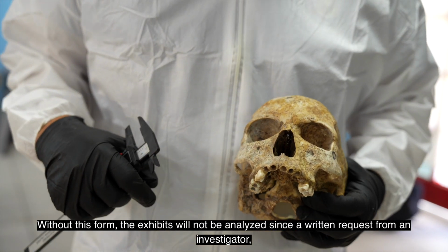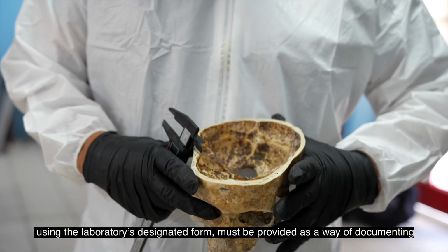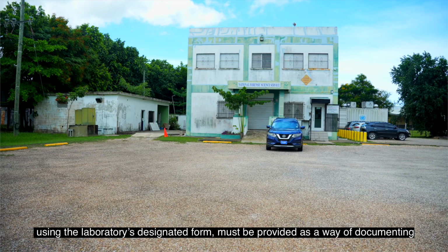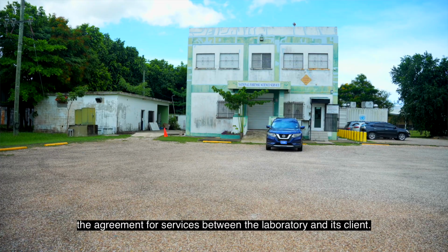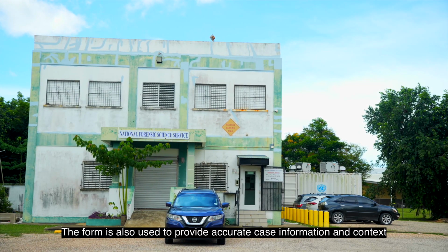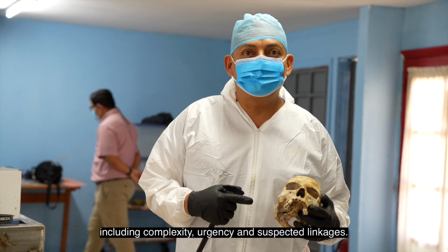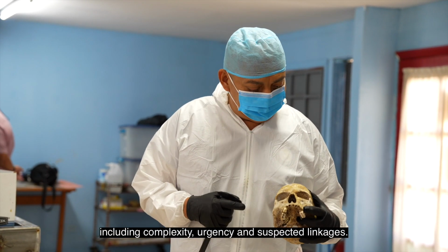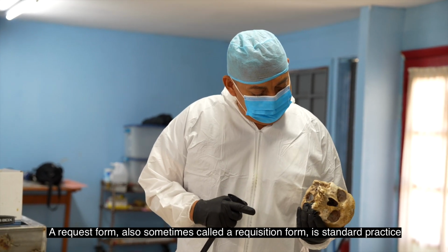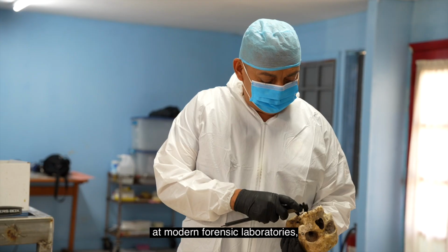Without this form, the exhibits will not be analyzed, since a written request from an investigator using the laboratory's designated form must be provided as a way of documenting the agreement for services between the laboratory and its client. The form is also used to provide accurate case information and context, including complexity, urgency, and suspected linkages. A request form, also sometimes called a requisition form, is standard practice at modern forensic laboratories, especially for laboratories that operate under a quality management system.